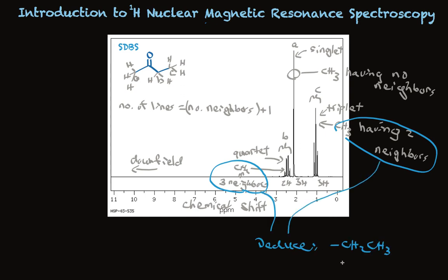So now you see we have 3 types of hydrogens. A methyl group by itself, coming in a region that is characteristic of being next to a carbonyl. We have an ethyl group with a CH2 coming in a region that is characteristic of being next to a carbonyl. This pretty much nails down the structure. Let's look at another example.